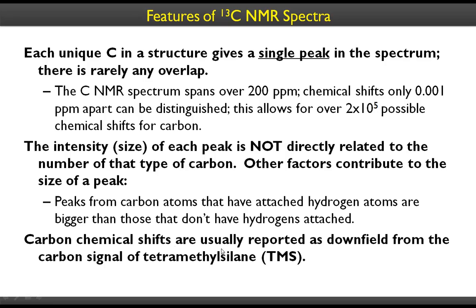The chemical shifts are usually reported as a difference from that of the reference TMS in ppm, not in hertz. We invoked something called delta value chemical shifts. We reference it to TMS, so wherever you measure, the delta value doesn't change.